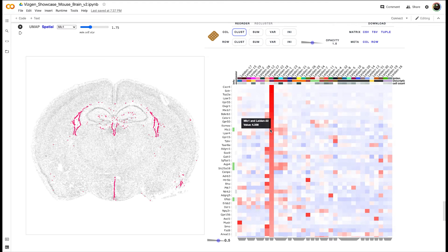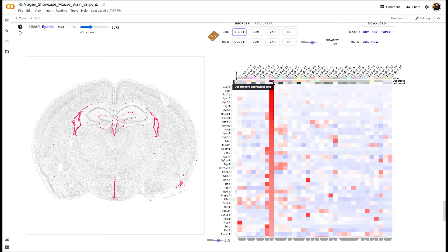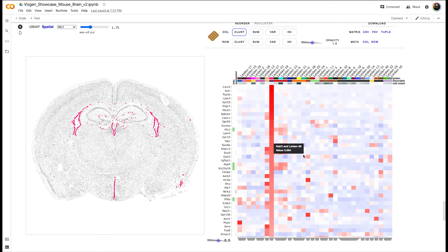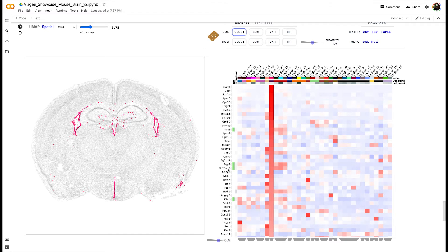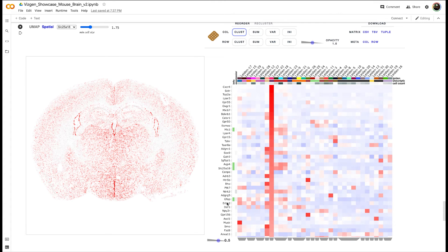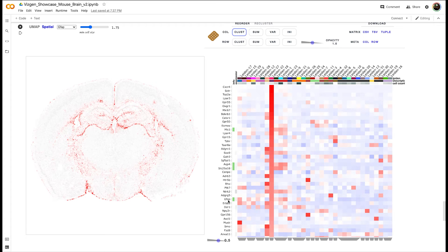Within this cluster we're seeing several genes that we would expect based on this cell type, such as MLC1, AQP4, SLC25A18, and GFAP, which are all glial markers.